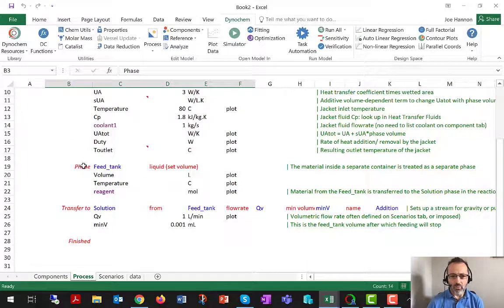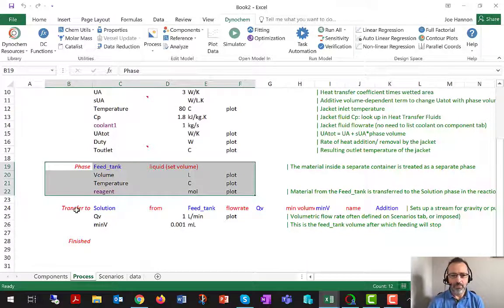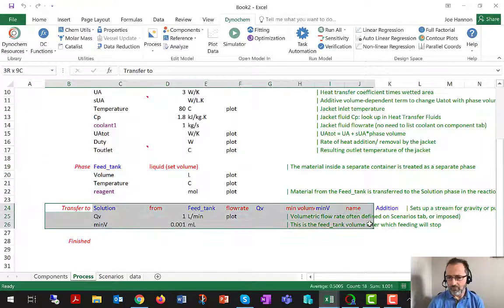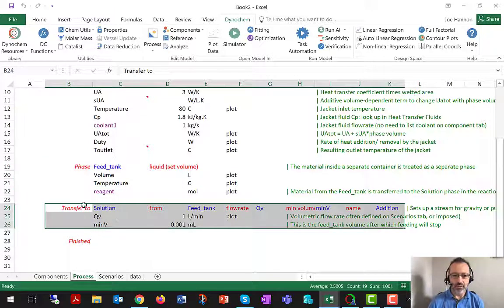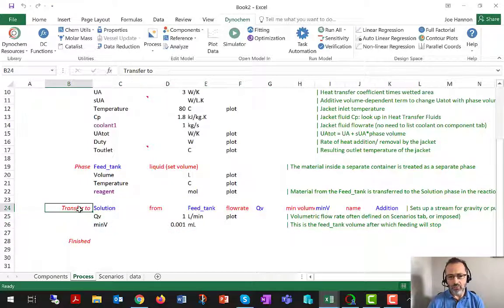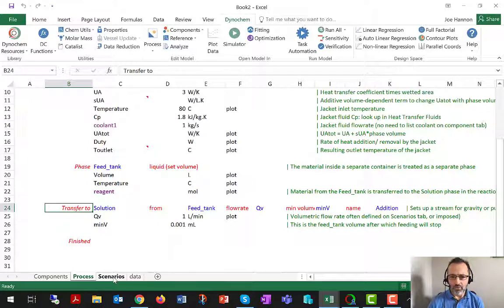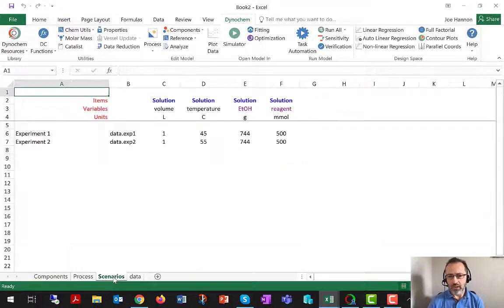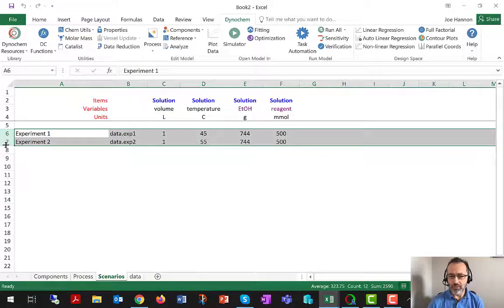Right now we've got a feed tank that's going to have reagent in it, and we've got a transfer of the contents of that tank to the vessel. In order to make this reasonably accurate, I'm going to now move to scenarios, which you haven't seen before, but that is where the two experiments are defined and where the initial values for those experiments are set up.